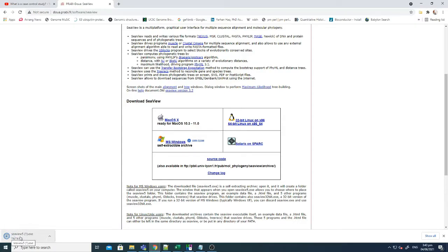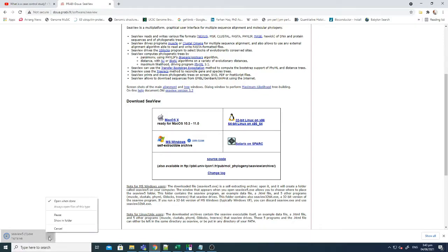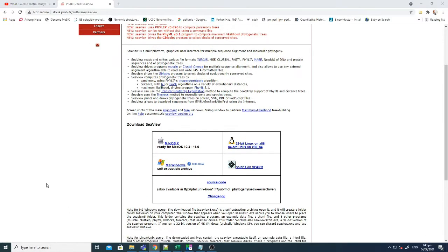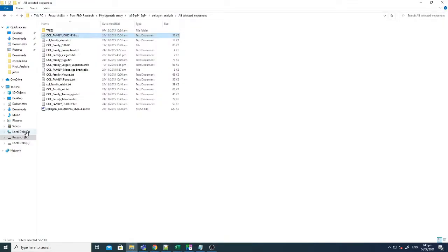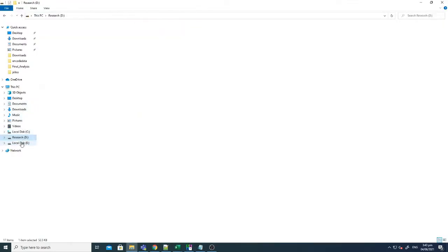And this will be downloaded. When you download this software you just have to run it once. So after downloading it you just have to go through the exe file and it will run.